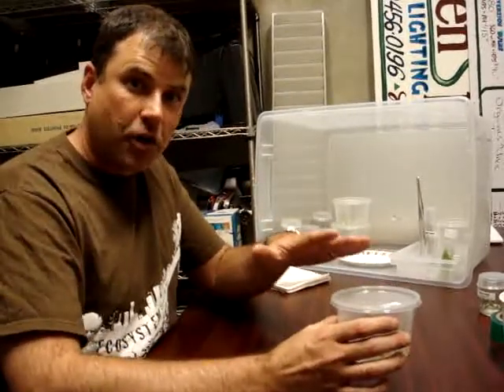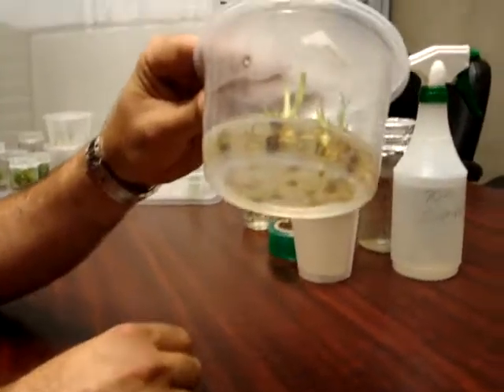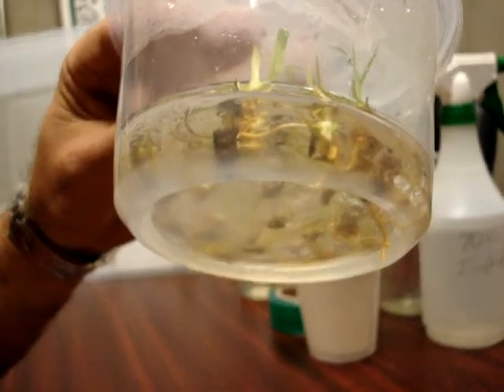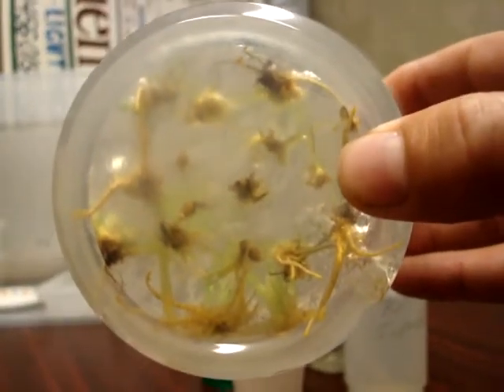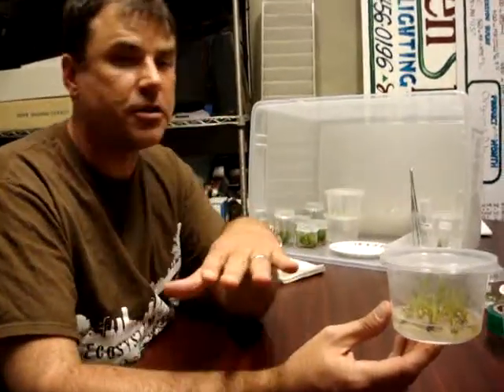The easiest way to start is from the back. This is a rooting tub with the roots on it — this tub is about three or four weeks old. These guys all came from one small baby food jar. This gel has the sugar, the nutrients, and the rooting hormone in it. Now I'll show you where this tub came from and how the system works.